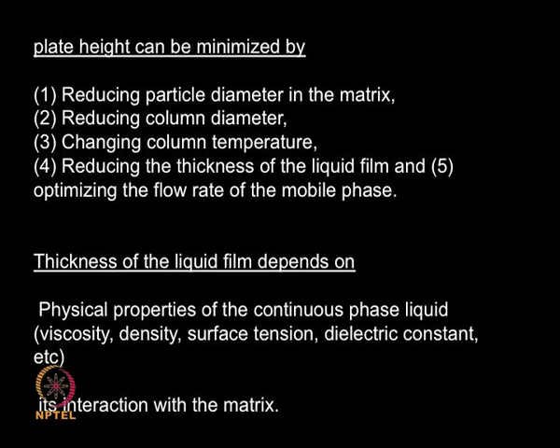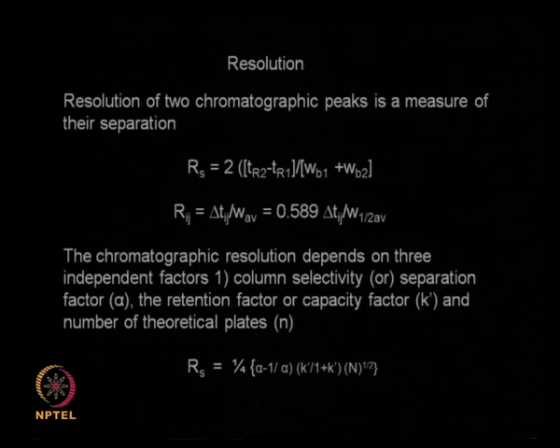The thickness of the liquid film especially comes into the picture when we are talking about liquid chromatography, and the thickness depends on physical properties of the continuous phase such as viscosity, density, surface tension, dielectric constant, etc., and also how it interacts with the matrix, that is the stationary phase matrix. There is another term which is called the resolution.